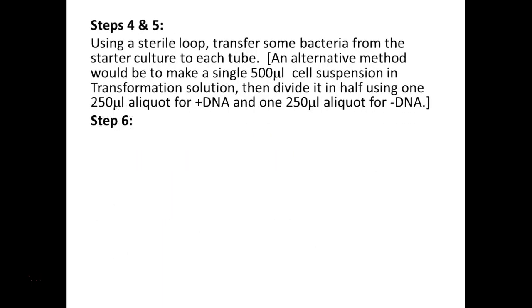You're going to use a sterile loop, and you'll notice in your bin you have plastic loops. I'll show you how to take those out of the container. You're going to use those to take a little bit of bacteria from the little plate that you guys see that doesn't have the white label on it. It has bacteria growing on it. That's your starter E. coli. That's what it says, unfortunately, on that plate in my horrible handwriting.